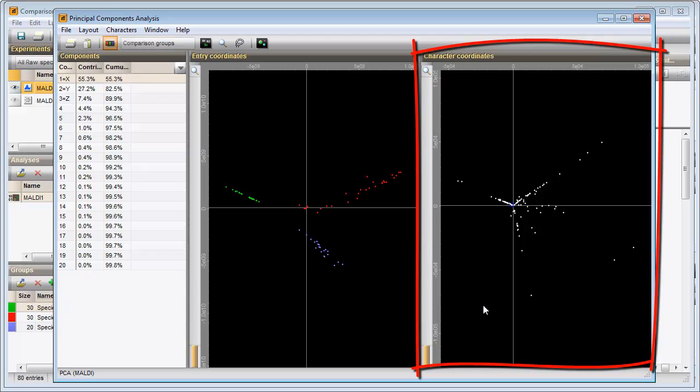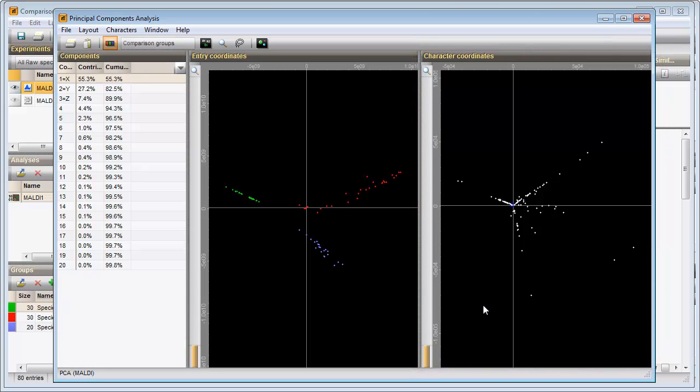The Character coordinates panel shows the plotted P-classes. A P-class that appears near the edge of the plot is a strong discriminator, while a P-class near the center is a weak discriminator. Furthermore, a P-class that appears near the position of an entry is an indicator for that entry.